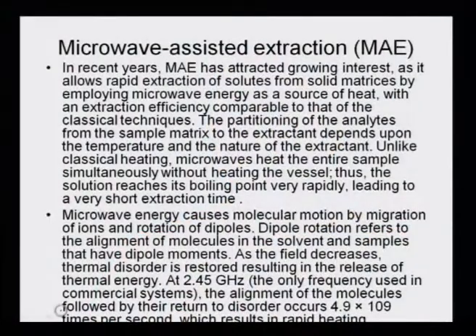The third other important type of extraction process is microwave assisted extraction, or MAE. In recent years, microwave assisted extraction has attracted growing interest as it allows rapid extraction of solutes from solid matrices by employing microwave energy as a source of heat, with an extraction efficiency comparable to that of classical techniques.